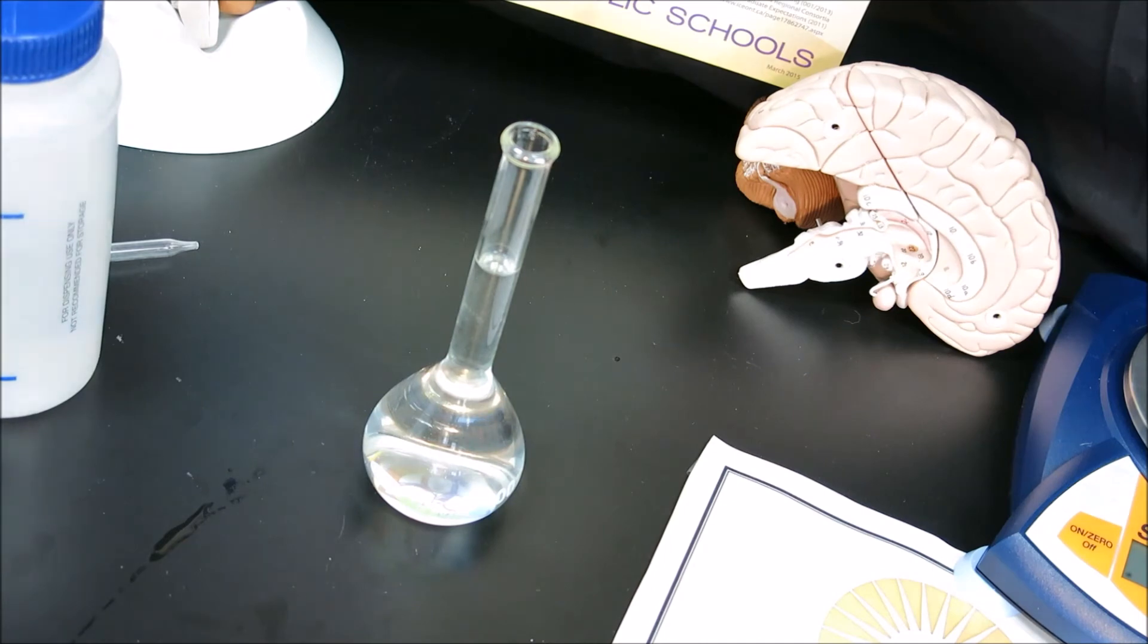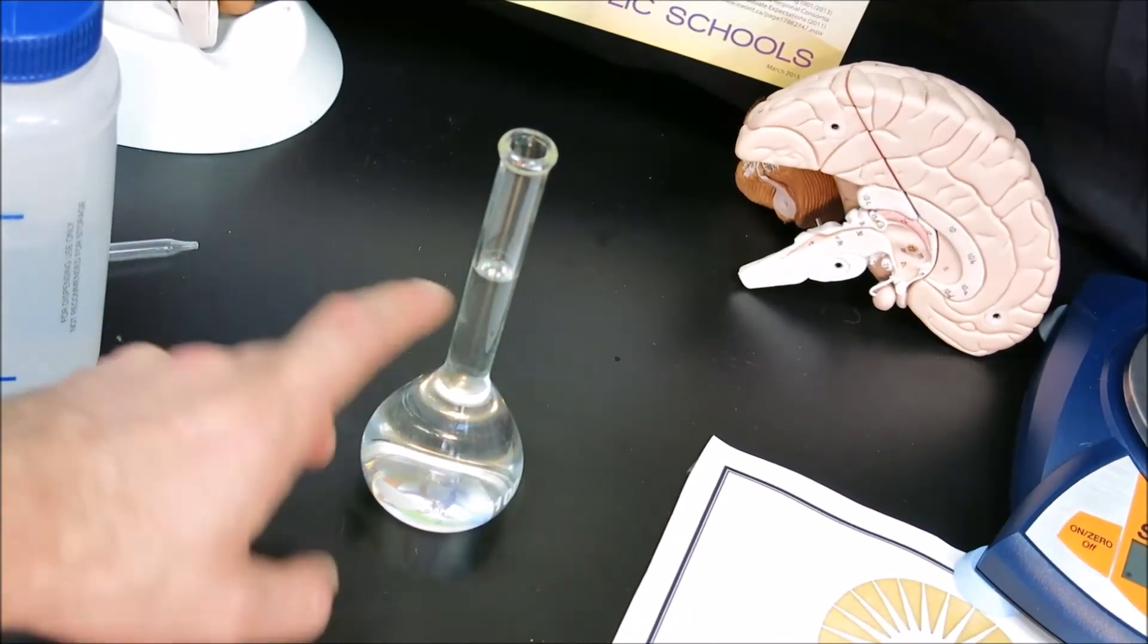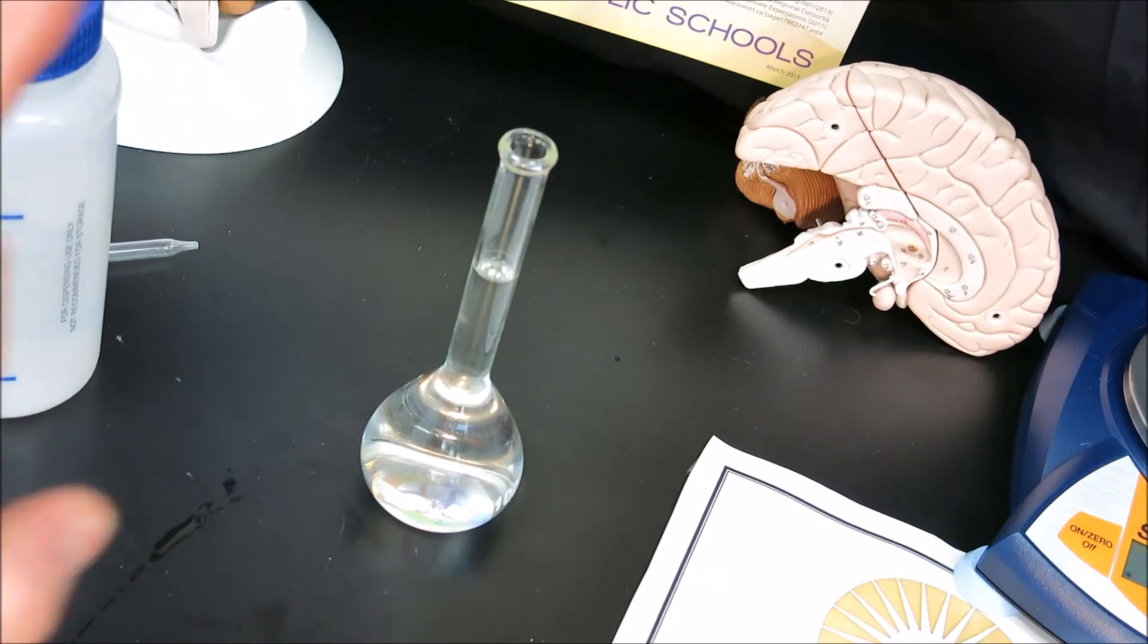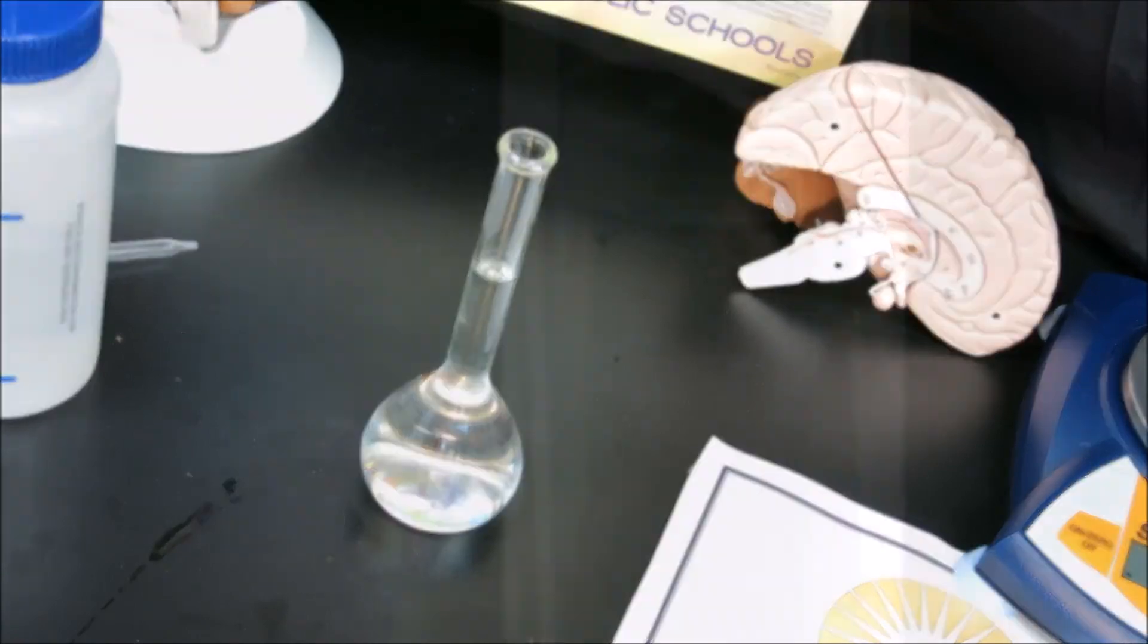At this point, it's very important to bring your eye to the level of that line, and you will try to see the line on the front of the neck and the back of the neck as one single line. If you can see both the front and back line, we call this parallax, which means your eyes are not exactly level with the line and you cannot actually see the meniscus in the flask.